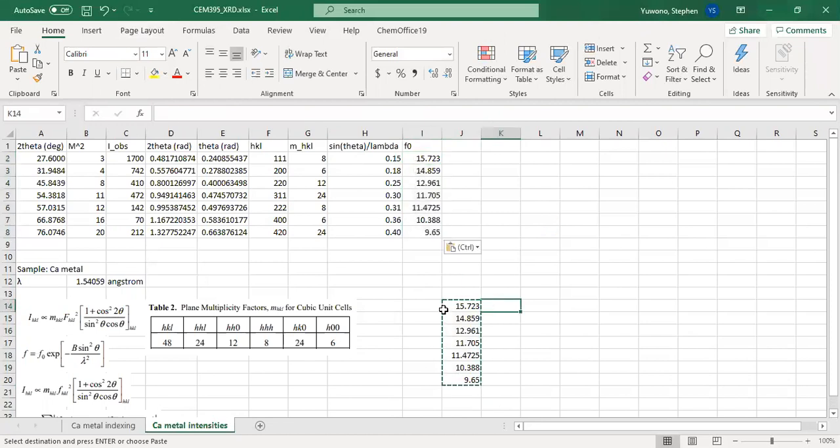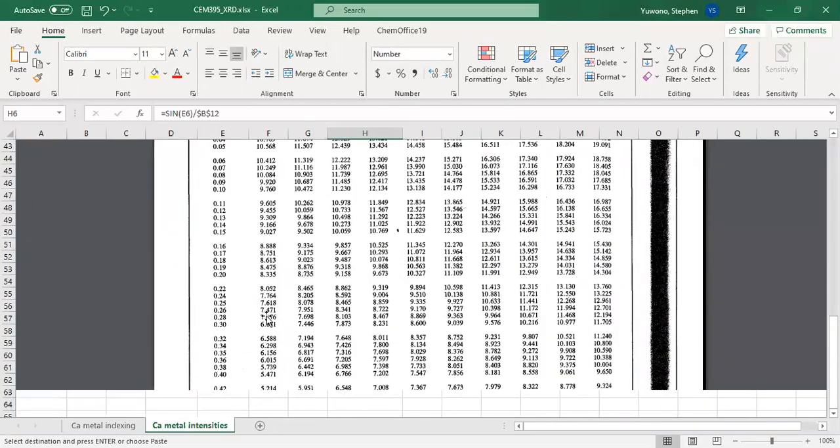Now, there is one thing that you might notice, which is that not all of the values that you get here will be available on the table. For example, 0.31 here is not anywhere on the table. So I have 0.30 followed by 0.32. What you can do is estimate what the value should be for 0.31: you just take the nearest neighbors and average them.